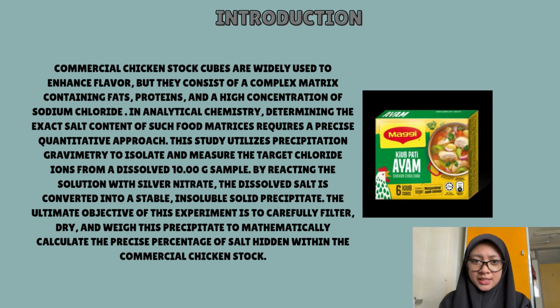How much salt is actually hidden in this concentrated cube? And how can we measure it precisely down to the milligram without relying on the labels? In this presentation, we will explore how we take this everyday food item, dissolve it, and use precipitation gravimetry to physically separate, isolate, and weigh the exact amount of salt it contains.